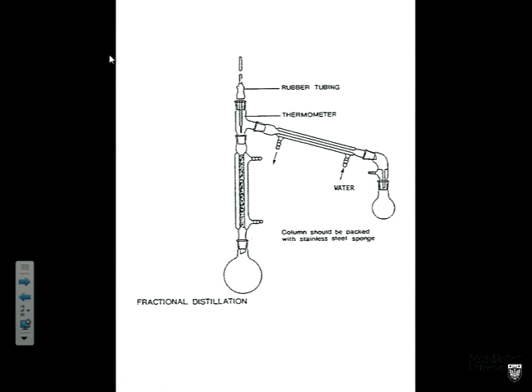Okay, if things get really difficult and the boiling points of our compounds are quite close, we can do fractional distillation. This is basically refining oil, essentially, is fractional distillation on the thousands of ton scale. We take the oil that contains many different organic compounds, some short-chain alkanes that are more volatile than the long-chain alkanes. We boil the whole lot, and we collect different fractions that distill at different temperatures. So fractional distillation is a slightly more sophisticated technique that allows you to get a better separation of volatile compounds.